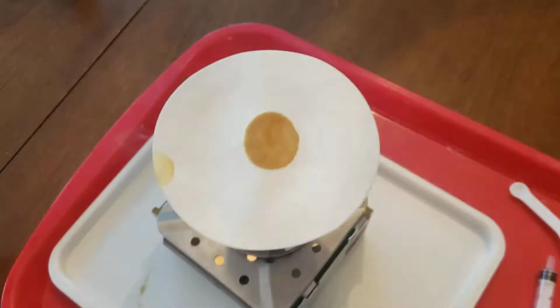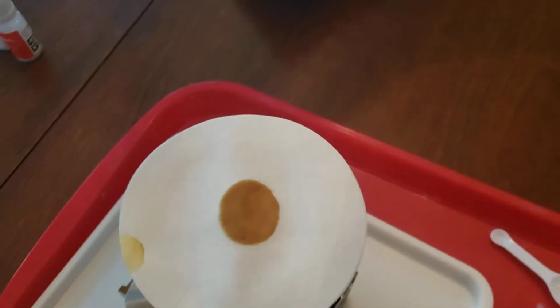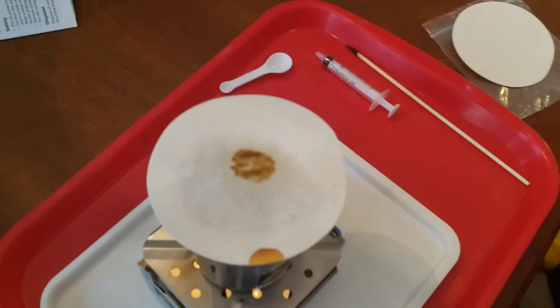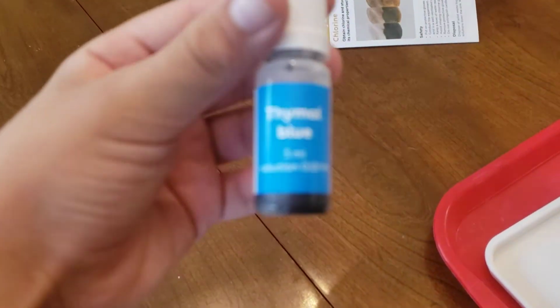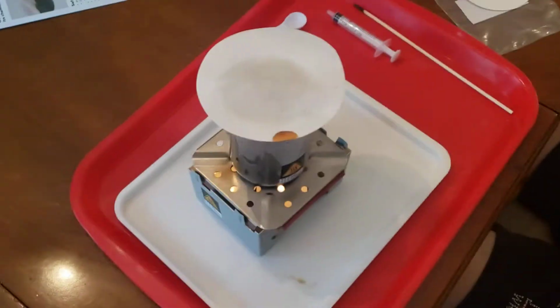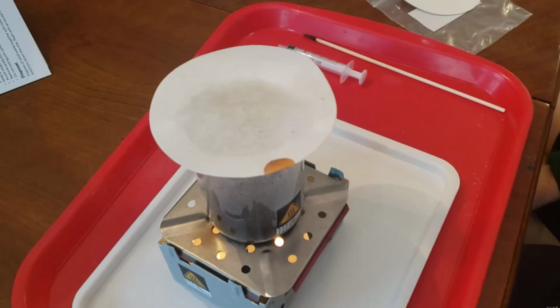And then soon, it says right here that like another 3 minutes after this, it's gonna look a little bit lighter. From the last time we saw it, it was really dark, and now it's like a faded color. And we're gonna put some water in it, and switch out this paper for a new one. Can't really see it, but yeah. Okay, so now it's all the way gone. There's no brown or faded at all. It's fully gone.